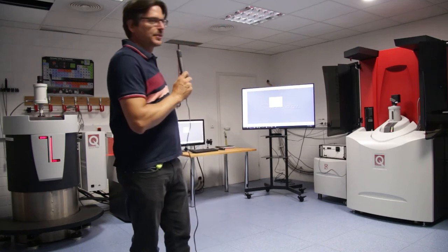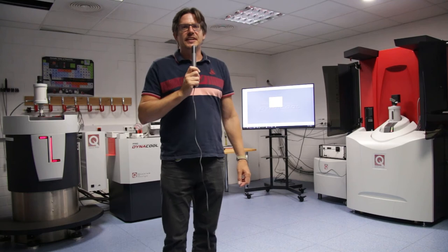Now we are in our application laboratory with two measurement systems, the MPMS3 and the Dynacool. We will measure with the Dynacool, which is a more versatile system. Both systems have a superconducting magnet, and I want to hand over to my colleague Stefan Riesner.